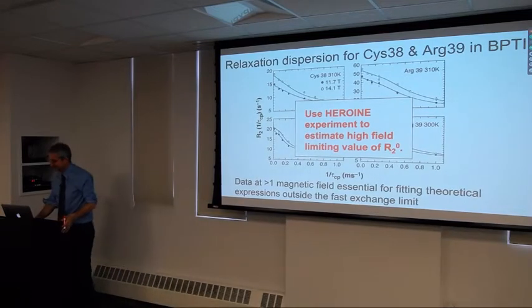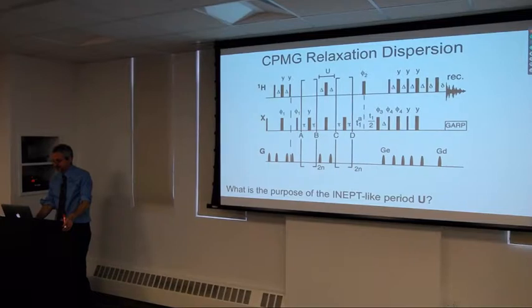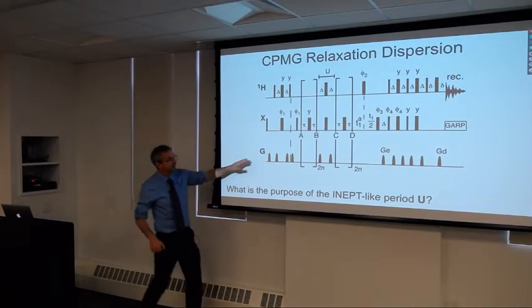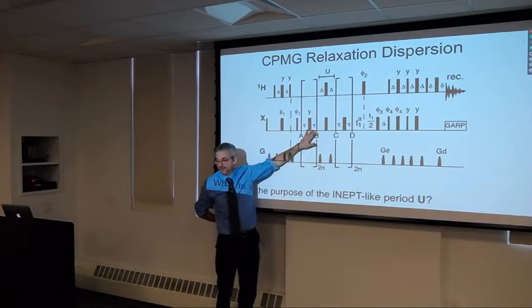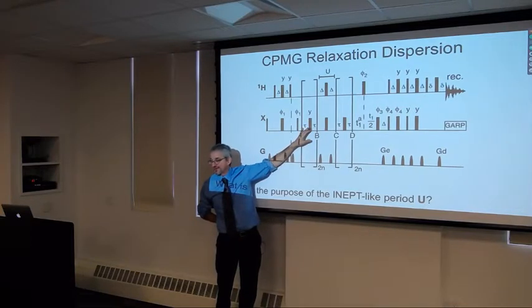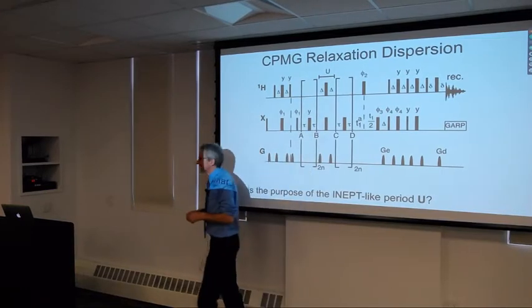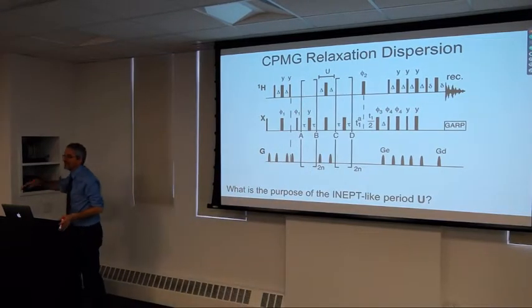And the Griesinger experiment just simply says, let's replace the spin echo here with the CW field so that we're doing an R1 rho experiment, and then turn the CW field on as strong as we can. And that turns out to be a very clever and simple way to get further out on the curve.